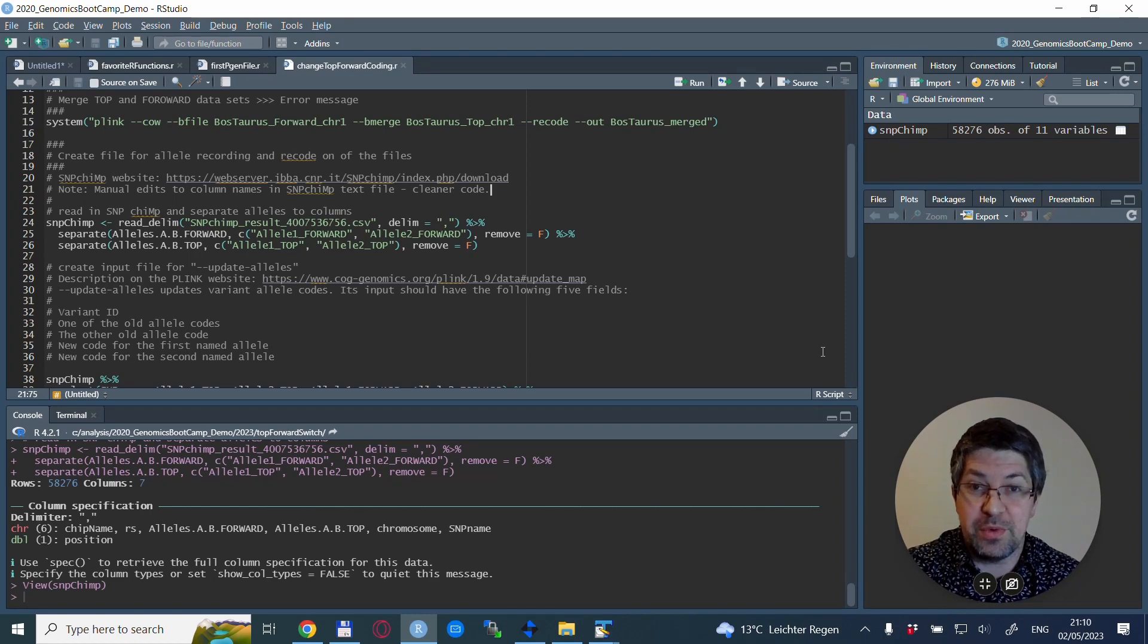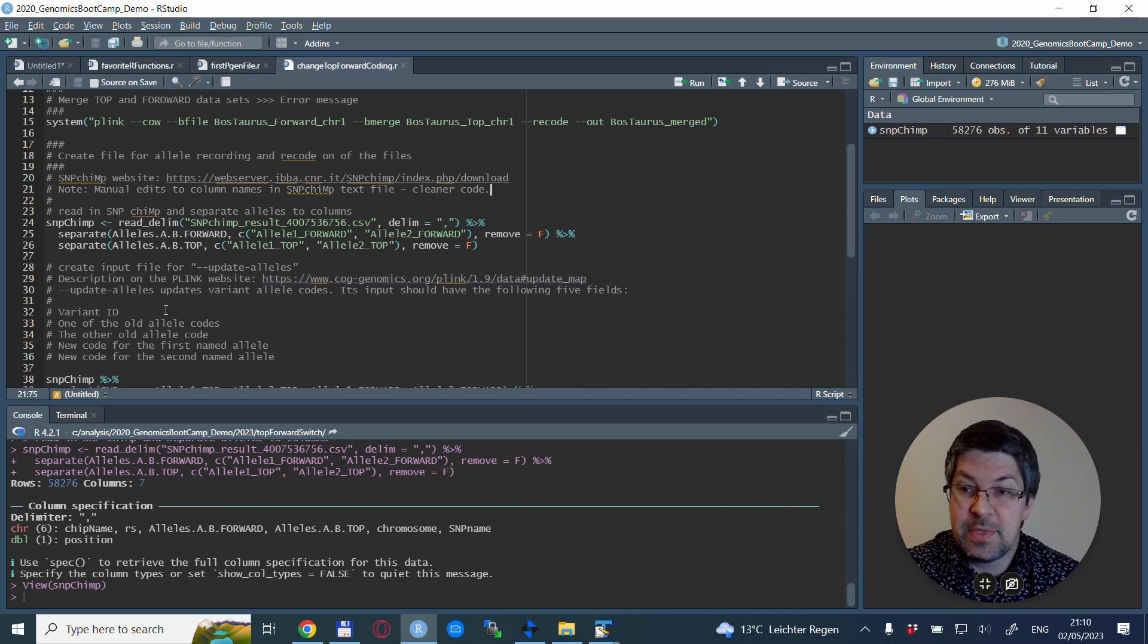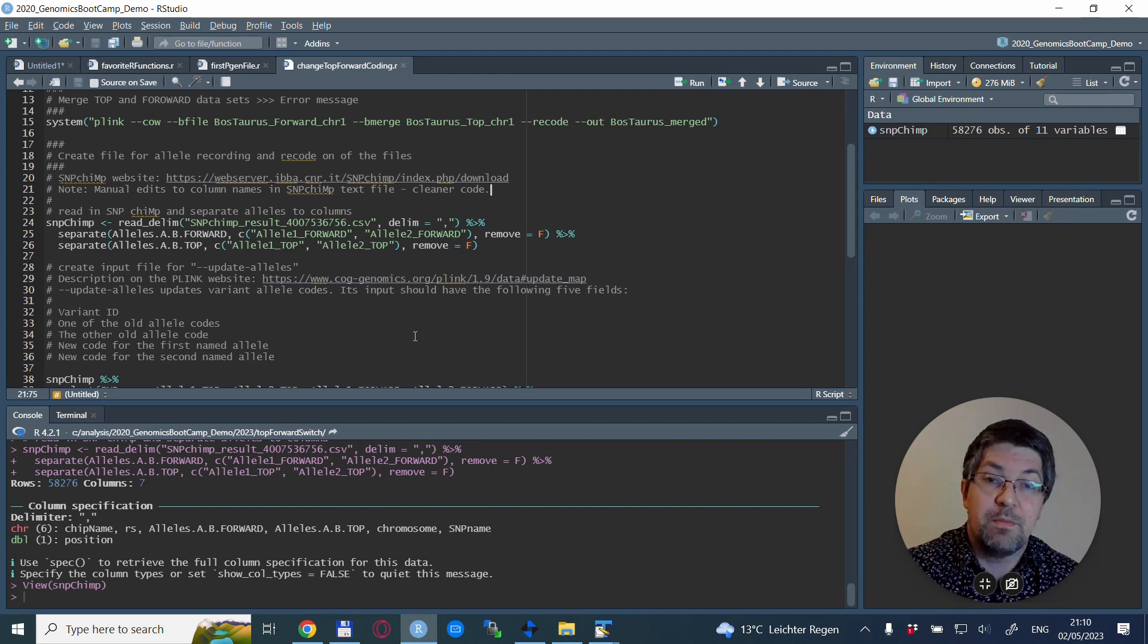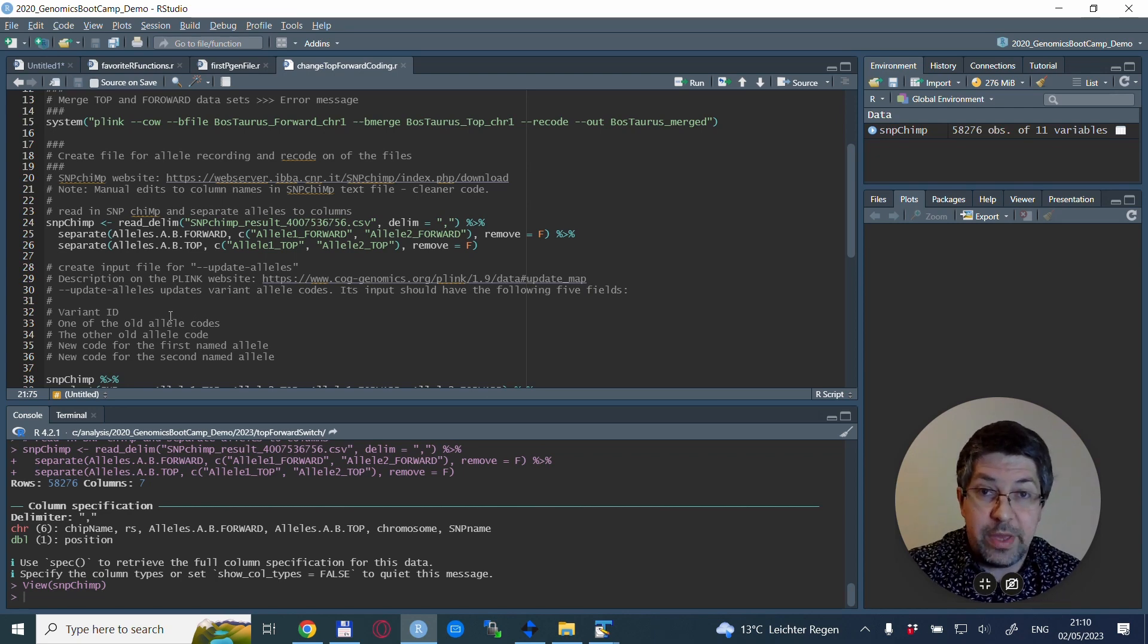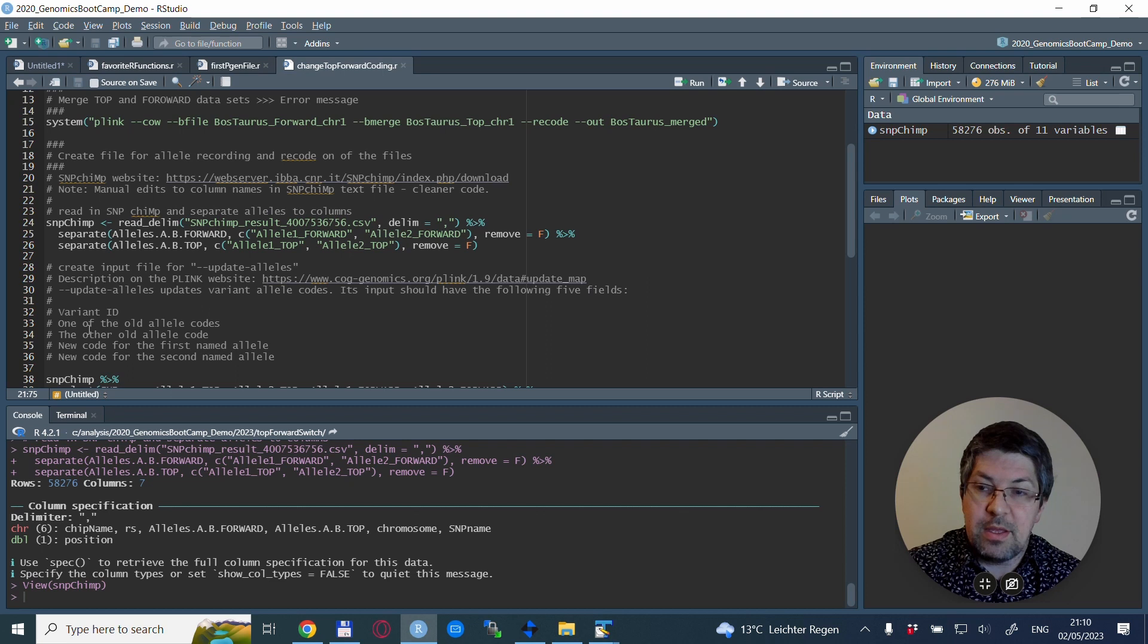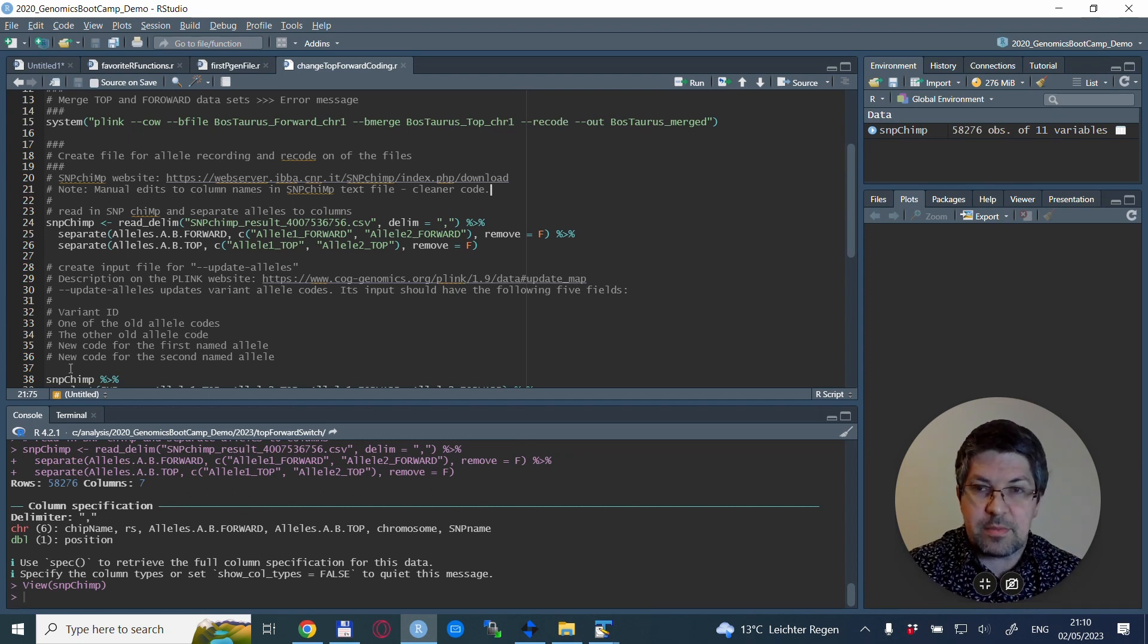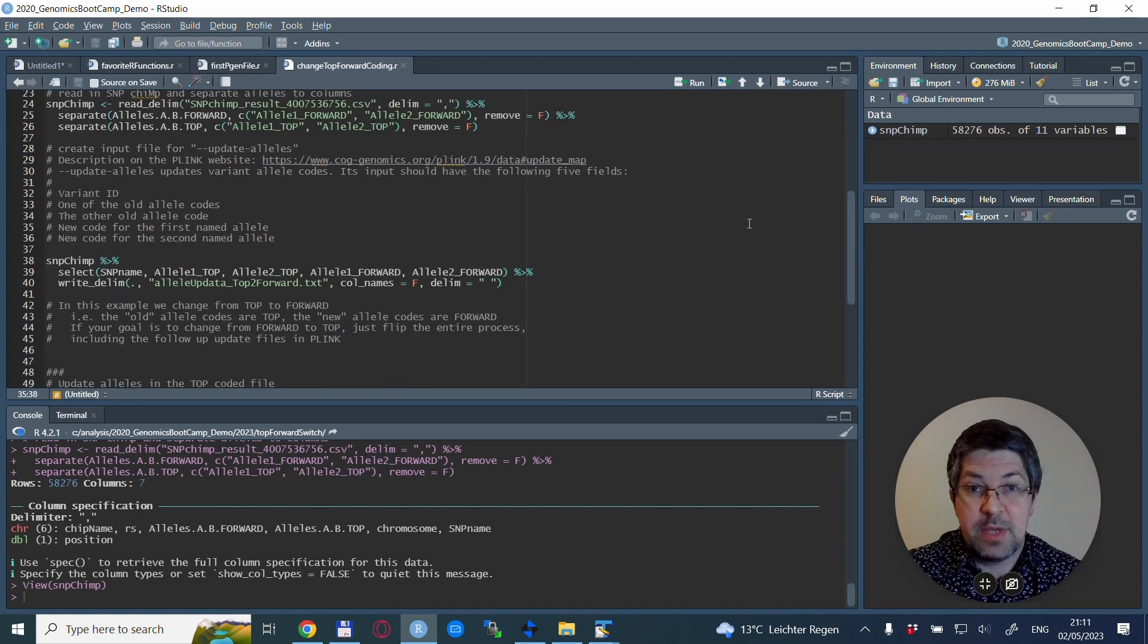The next thing is to create the file which we will use with the --update-alleles PLINK command. You can check out the PLINK website for detailed description. What you will see is that you need a file with the following columns: first the variant ID, then one of the old allele codes, the other old allele code, then the fourth column should be the new code for the first named allele, and the fifth column the new code for the second named allele.